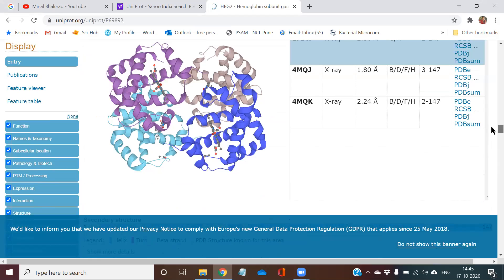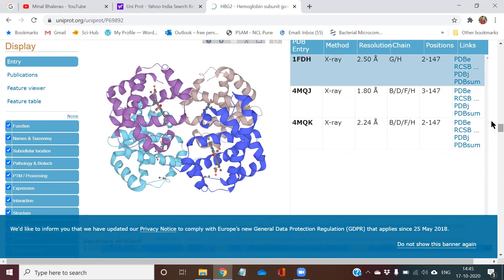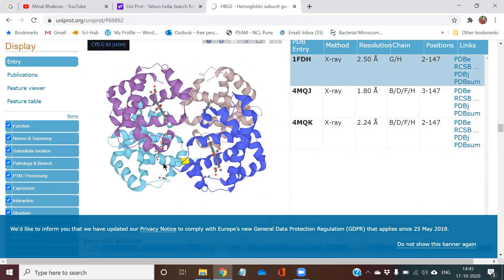As you scroll down, you can see the structure of hemoglobin protein. So these are all alpha helix.